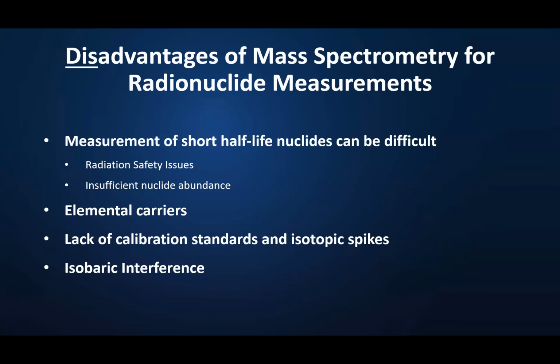So Mike, before I get to you, I see your hand is up. Simon has a very good point. You can, of course, correct for decay during the measurement using the decay equation over the measurement time. I think, though, in mass spec, unless you have a very well characterized instrument, I don't know how precise the timing of the data output from the mass spec might be.